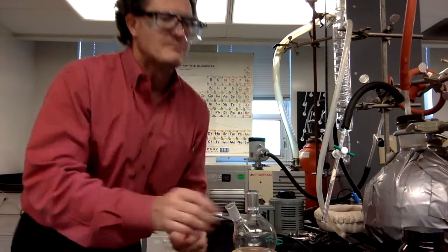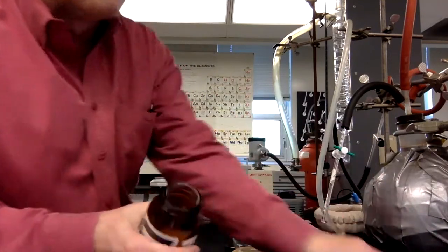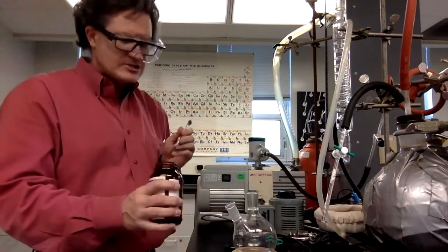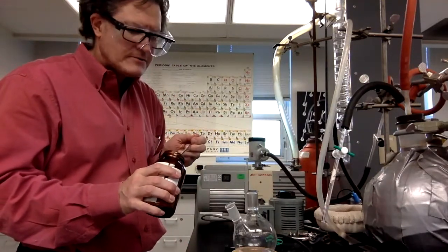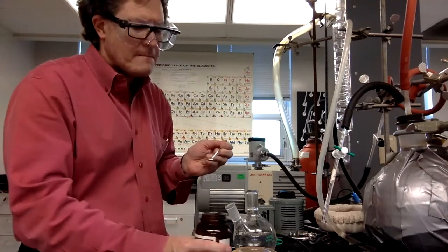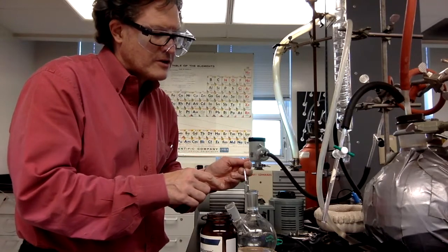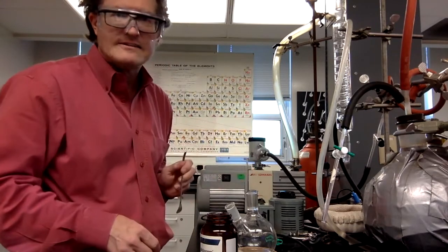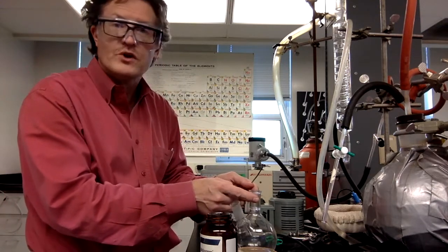So we're going to put a couple of boiling chips in. Now, got to be careful. Boiling chips are kind of powdery, right? You only need a couple. And they're kind of powdery because they're all banging against each other. And when we stick them in here, we want it to go straight down the center. Okay? We don't want to get any dust on the joint up here.